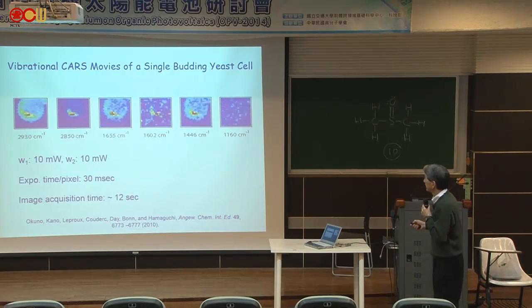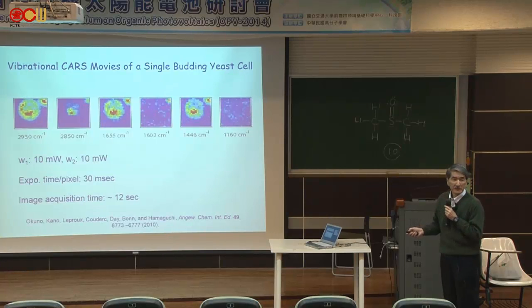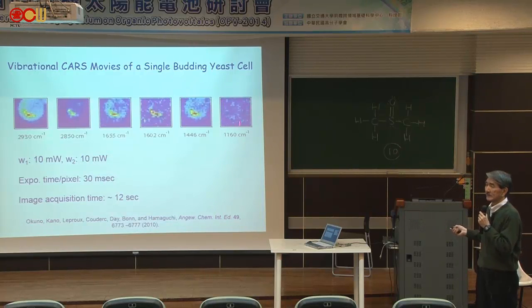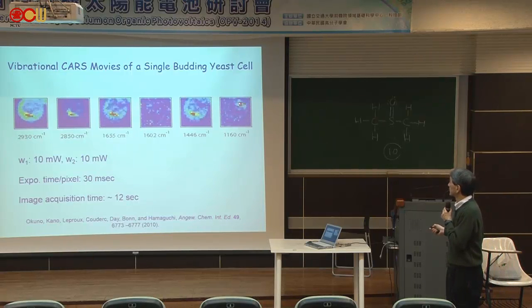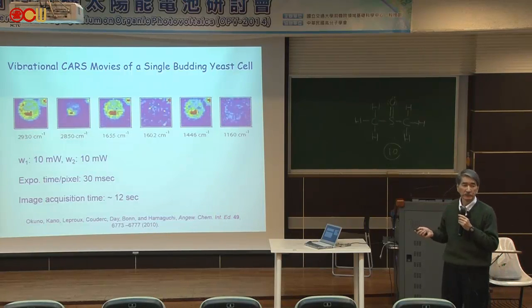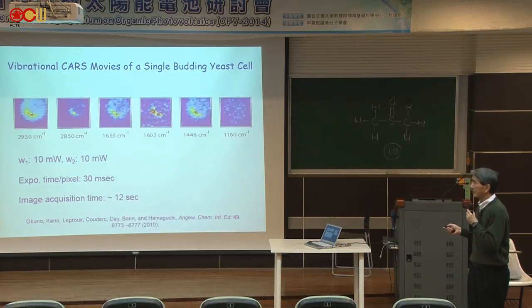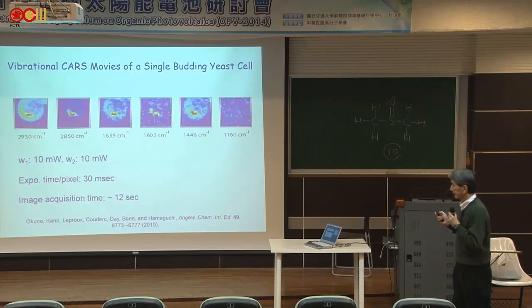Repeat here, that's still 1602, and then it disappears, and the dancing body appears, and then the cell structure is destroyed. The process that I showed you is reflected in this movie. And we are now convinced that the dancing body appears after 1602 disappears. So it's certainly related. So 1602 is somehow related with the living activity of the cell. But why?